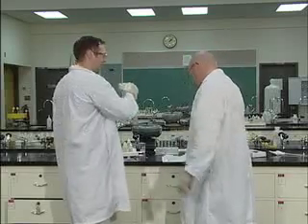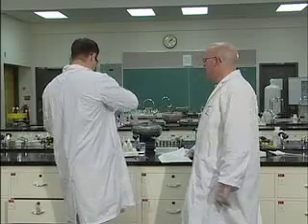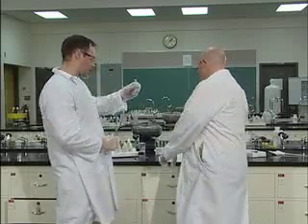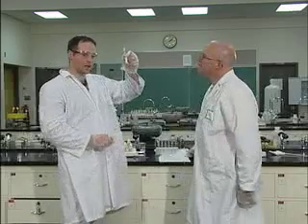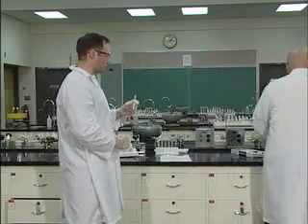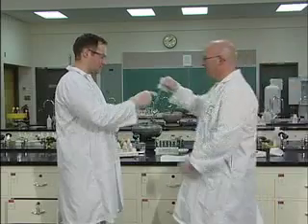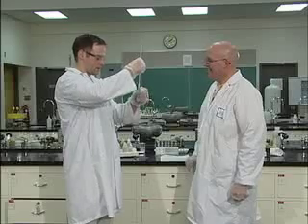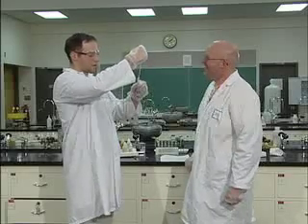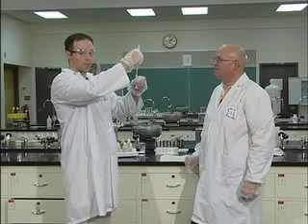So again, we have our sodium carbonate, 30 drops of sodium carbonate. We're going to measure the initial temperature of this one more time. So we have a clean, dry thermometer. Perfectly clean. Time-lapse photography, obviously. And again, we're going to notice this is probably right on 25 degrees or thereabouts.